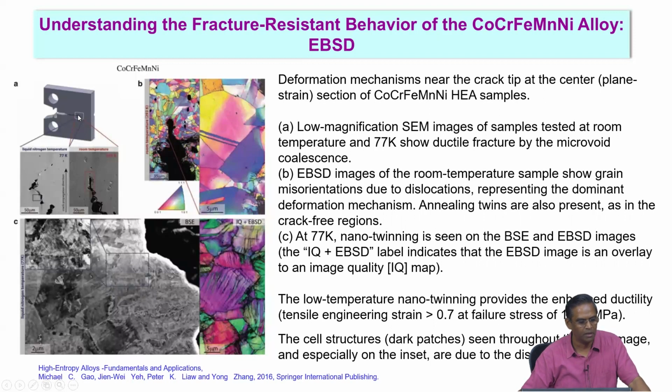It is done by fatigue loading, so a naturally grown crack is extended to the predetermined length, and then finally you pull them. Once the natural crack has grown to the predetermined length, you pull the sample and look at the load versus displacement curve. From there you calculate the toughness. That is part of a mechanical behavior course you would have studied.